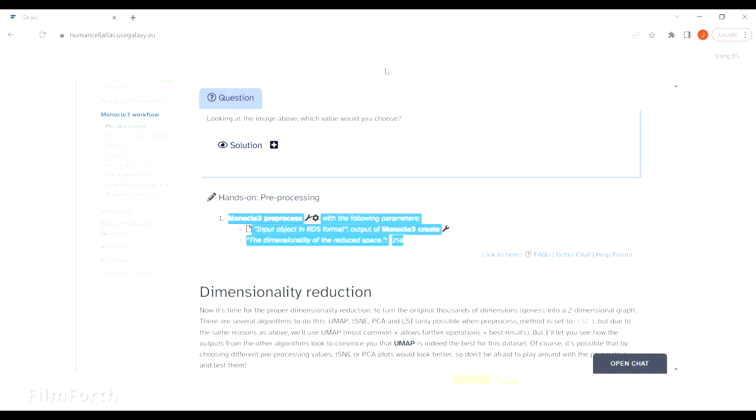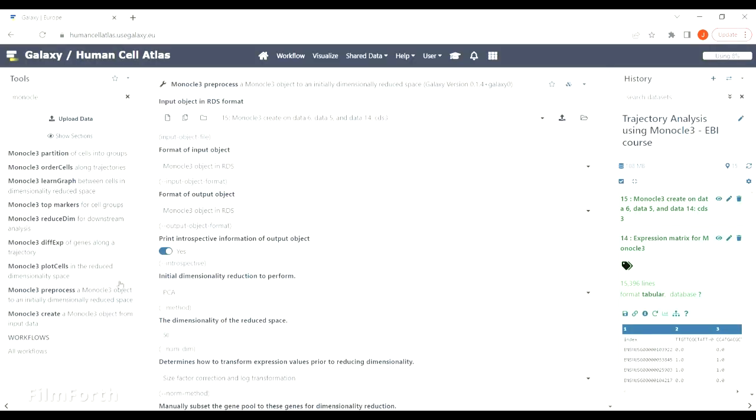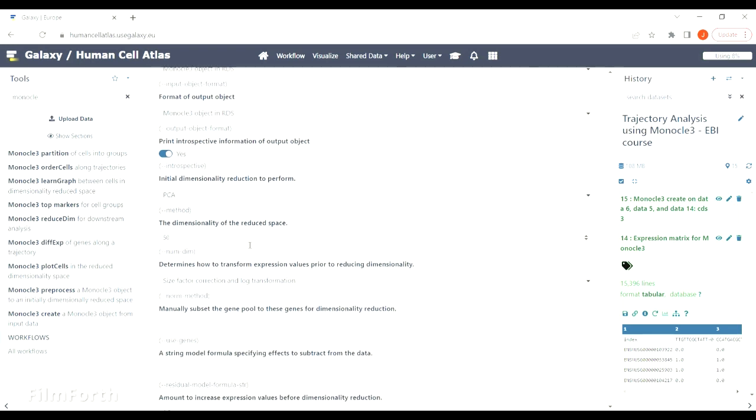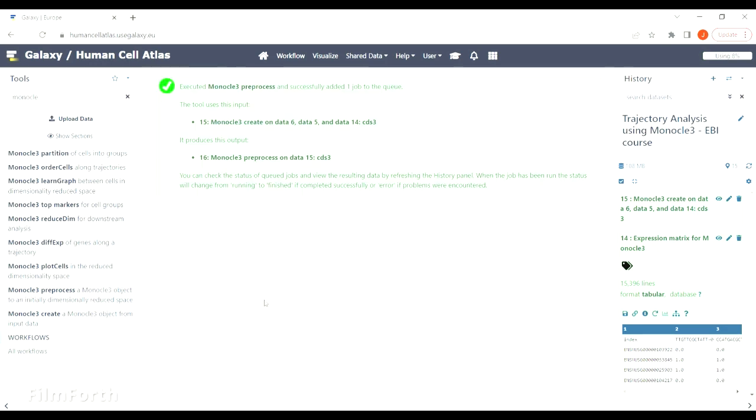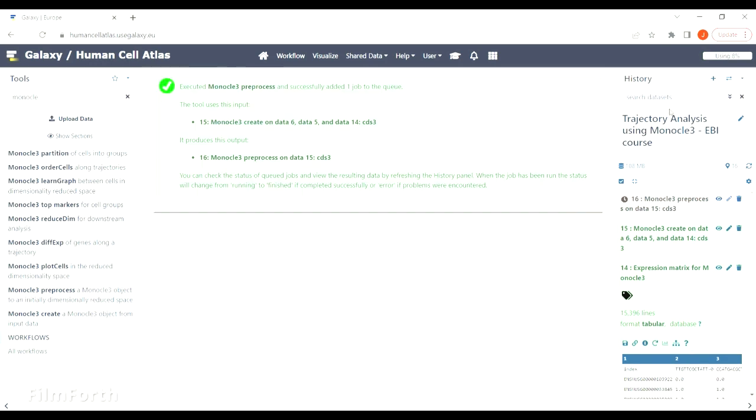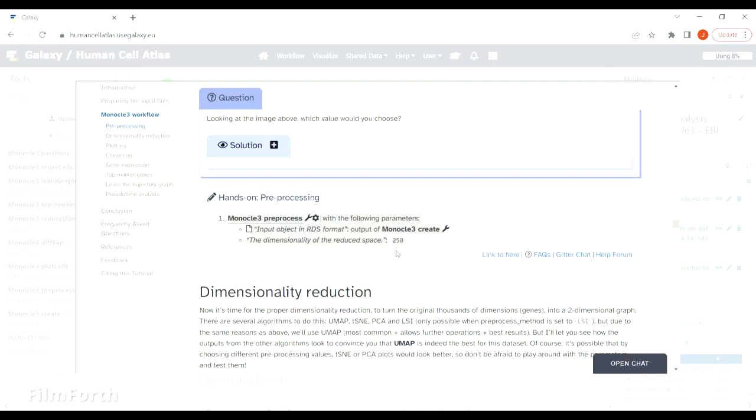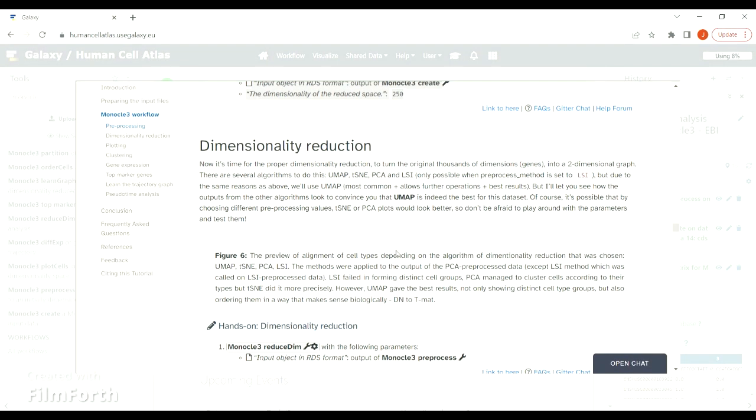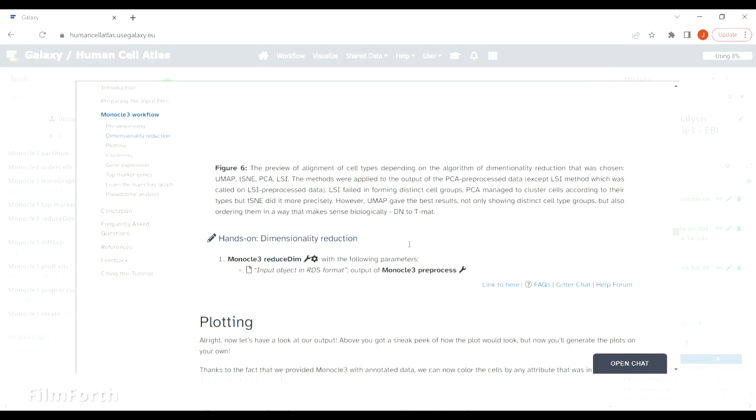We will accept the default settings except dimensionality of the reduced space, which we will set to 250. The explanation why we use this value is in the tutorial, so have a read through that, but you are very welcome to play around this value so that you understand what it changes.